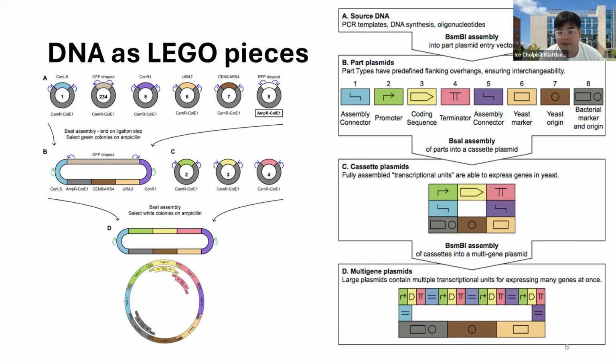One concern that I want to share right now is that in synthetic biology and molecular biology, there is a lot of context-dependent behavior going on. So when you put things together like this, if you put them in the order of 1, 2, 3, but change it into 1, 3, 2, there might be some differences. That would be something to be concerned about, but we skip that for now because we want to keep it very simple.